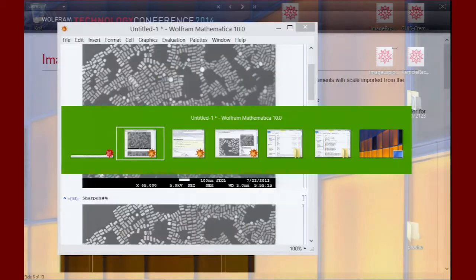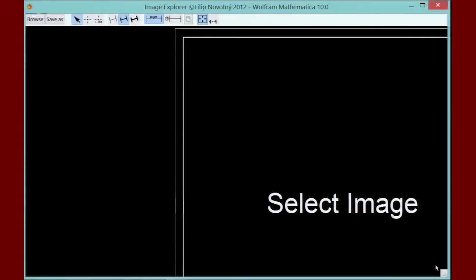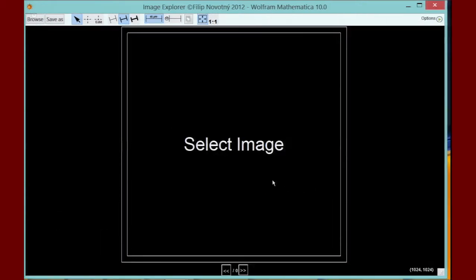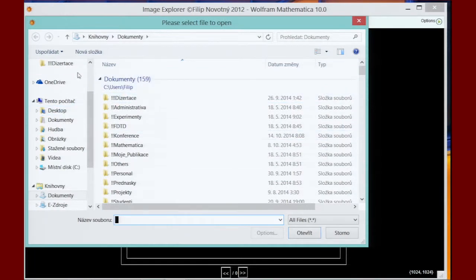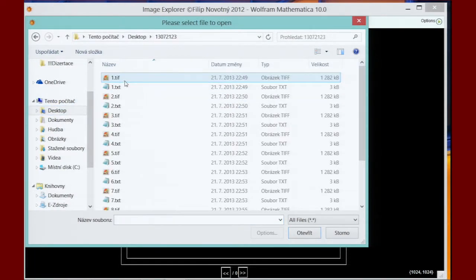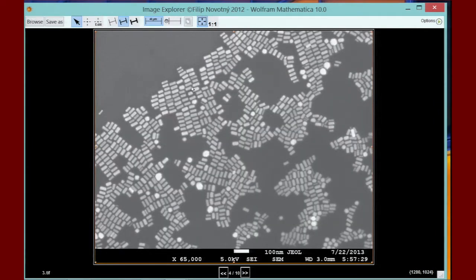This can be done in Mathematica very easily by preparing this kind of dynamic environment, which is actually a Mathematica notebook, a window which has been stripped of the usual cell background and cell helpers on the side, and which can act as a simple image browser, with the difference that you can take calibrated measurements inside the image.